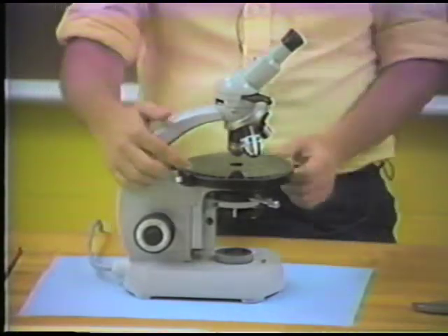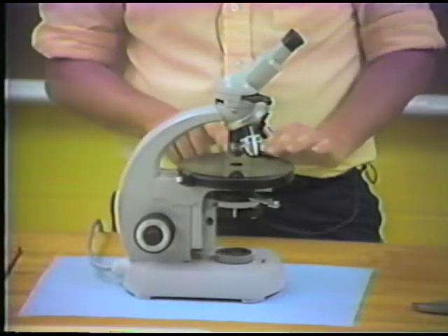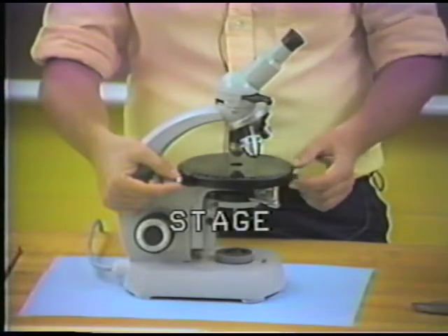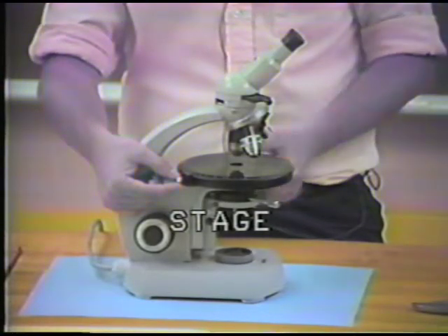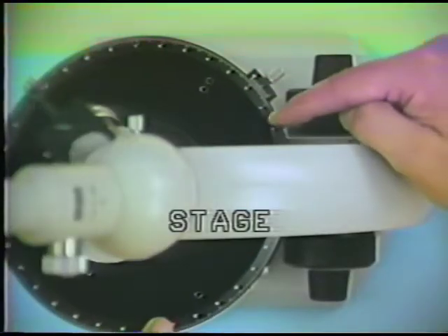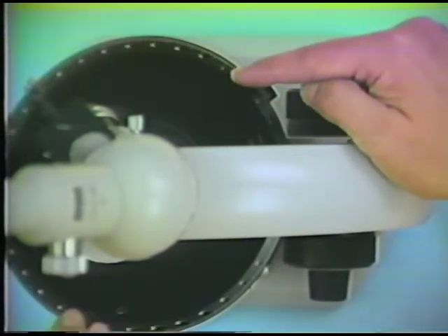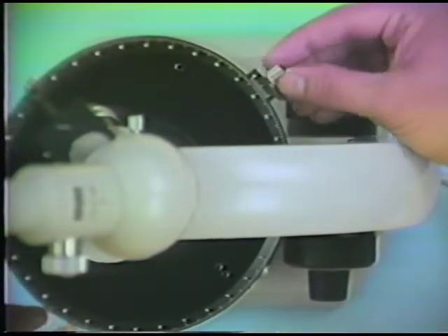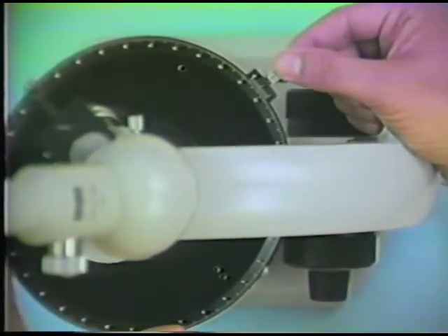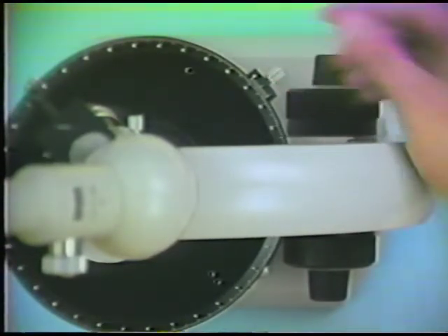The next thing I want to show you is the stage of the microscope. Obviously this is where you put the specimen on the microscope. And the stage has the ability to be rotated. And this is a very important property. Furthermore, you can control the rotation because there are actual graduations, and every angular point is graduated and numbered on the microscope. And you can lock the stage so that it cannot be moved or rotated by using a set screw on the side of the stage.